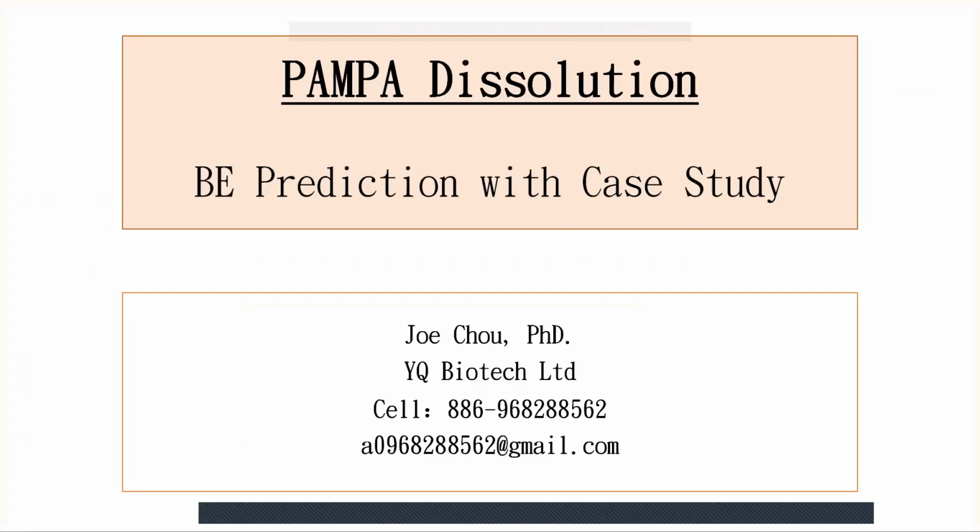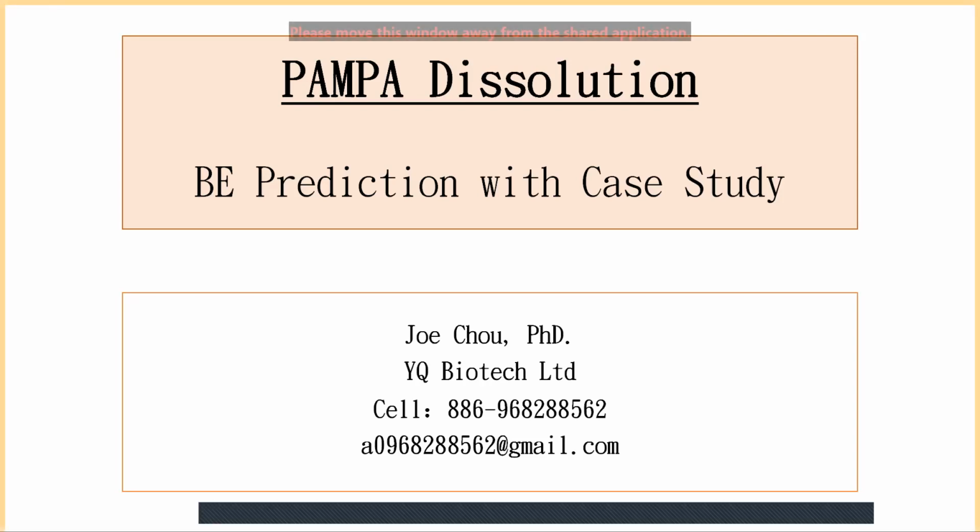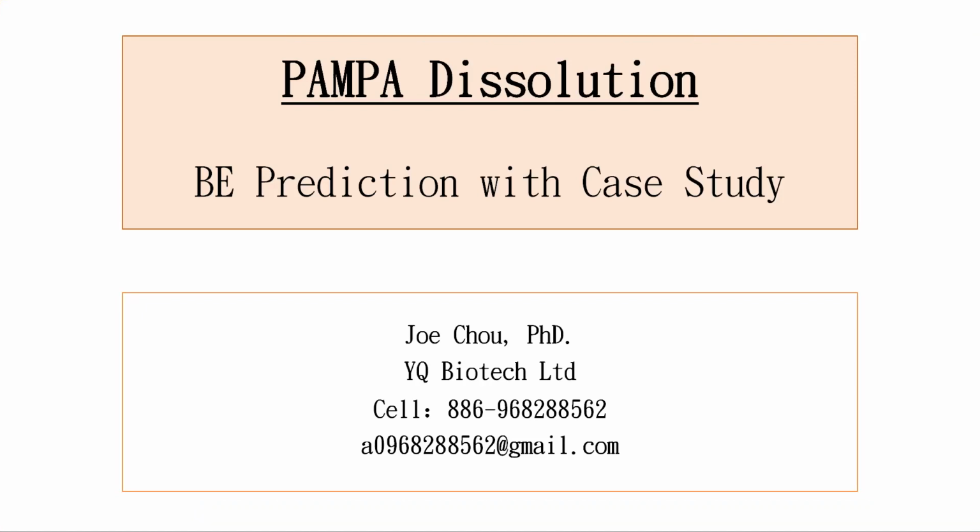BE means bioequivalence. I think everybody recognizes that. In addition to this bioequivalence prediction, it can be used in terms of 505(b)(2), because 505(b)(2) measures these Cmax and AUC parameters. So both of these parameters, AUC and Cmax, can be easily predicted using this instrumentation.